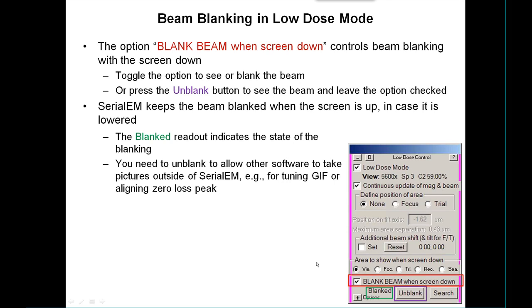Controlling the beam blanking is very important in low dose. The option here, blank beam when screen is down, controls whether the beam is blanked when the screen is down. If you do have the screen down, you can toggle this on and off to see the beam, or you can just press the unblank button and then it will be on until the next time you raise the screen. The option will still stay checked to keep the beam off if you lower the screen again. SerialEM also keeps the beam blank when the screen is up in case it gets lowered, because it can't anticipate fast enough that it needs to blank the beam when the screen is lowered.